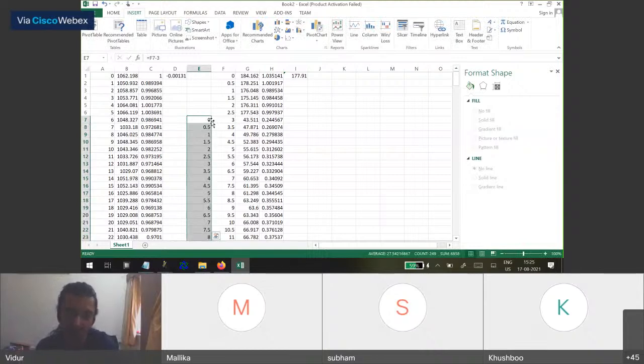And you just double click it so that now this is reoriented such that your first post bleach is 0 seconds. Now, if your microscope does not support time series that is exported as metadata, you'll have to manually put whatever frame rate it is.